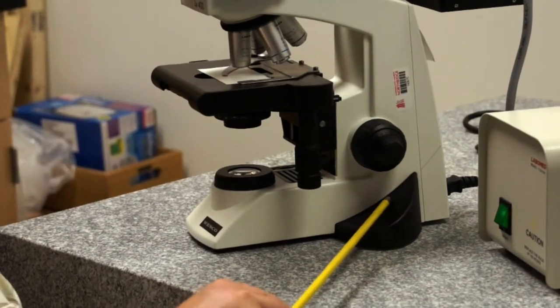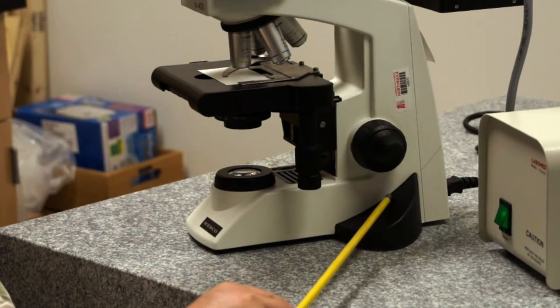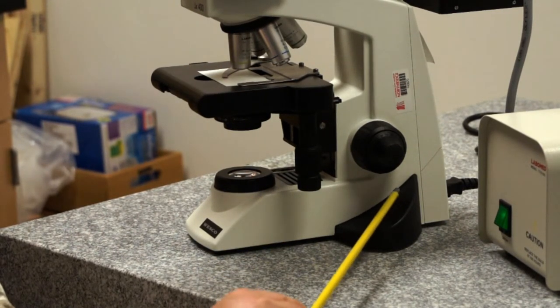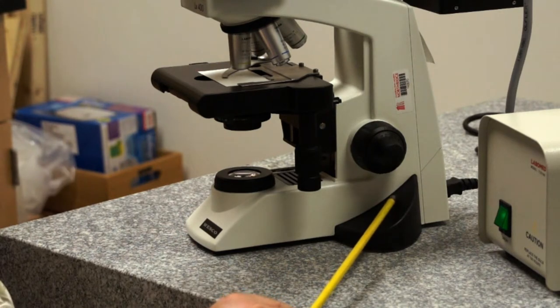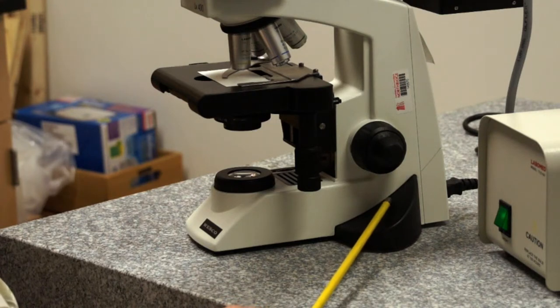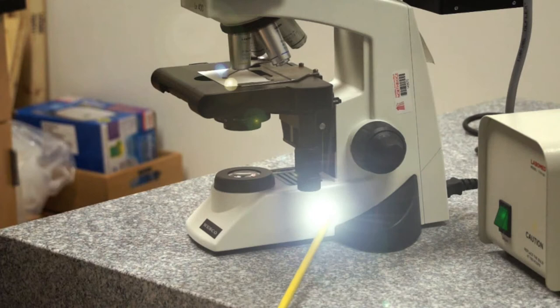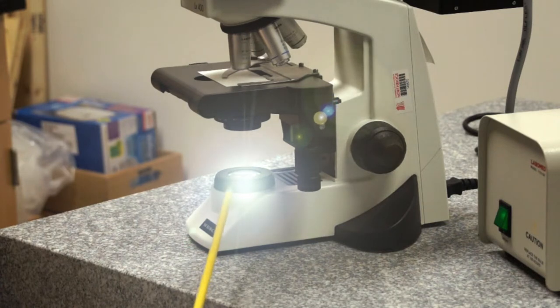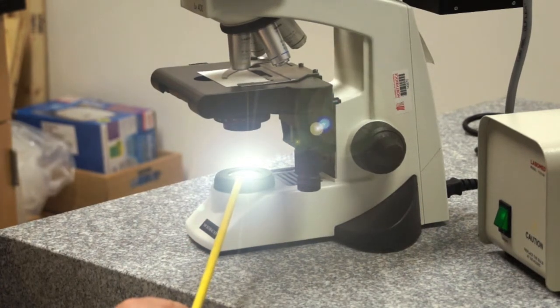Built into the stand in the base is an illuminator. An illuminator supplies light to the microscope. In this case we have a tungsten halogen illuminator built into the base with a tungsten halogen bulb that burns very bright and very white. And that light travels from the bulb and the lamp housing up to a right angle mirror in the base, and then it comes vertically through the field diaphragm of the microscope.